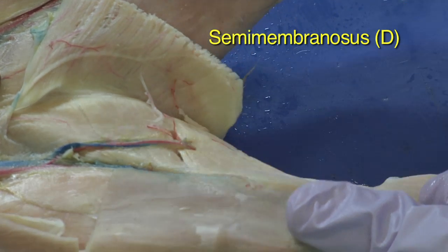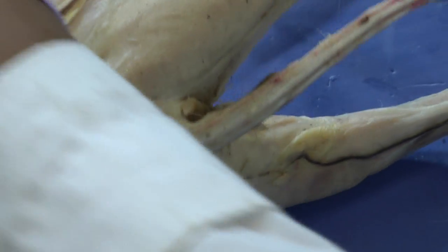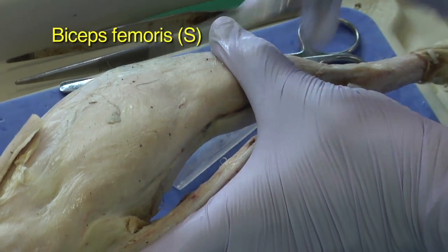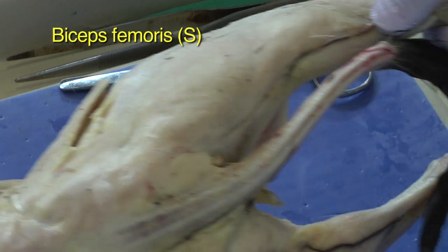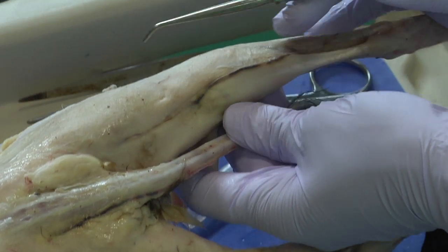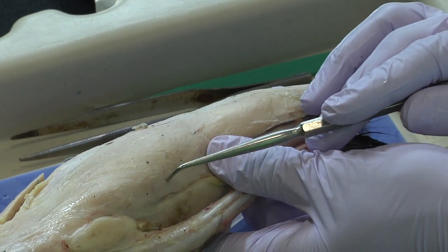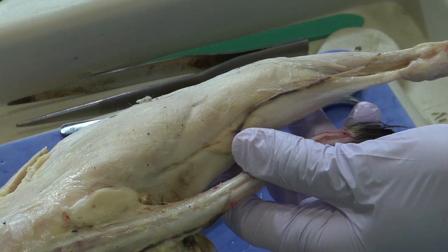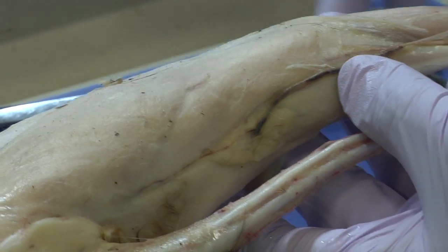All right. Now, for the other two muscles that are part of the hamstring, one is going to be this really broad muscle, the biceps femoris, which runs along the side. And then if I turn the cat over to the dorsal side, the other is going to be the semitendinosus. And so to see the semitendinosus, I'm actually going to need to create a boundary between the biceps femoris and the semitendinosus. So I've kind of marked out where that division is with the probe.